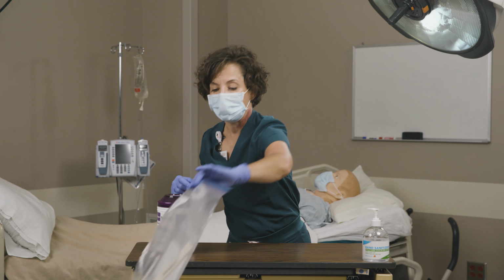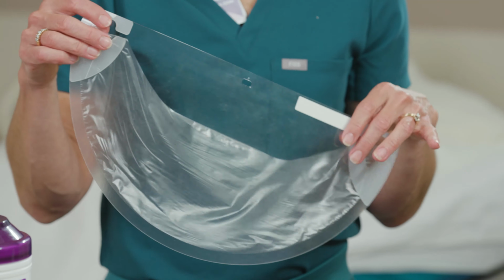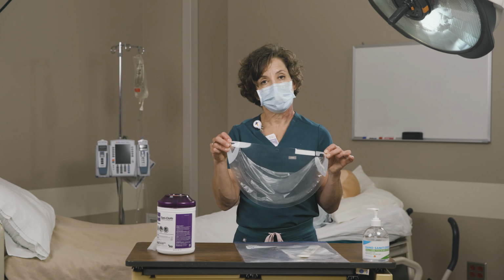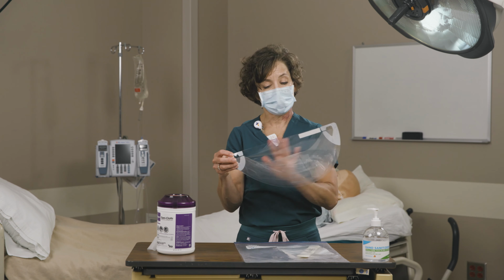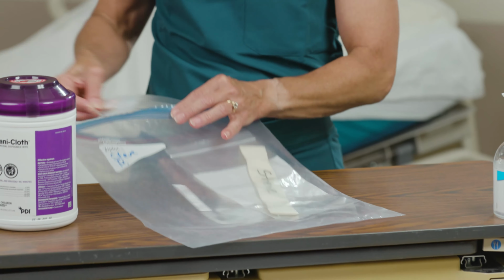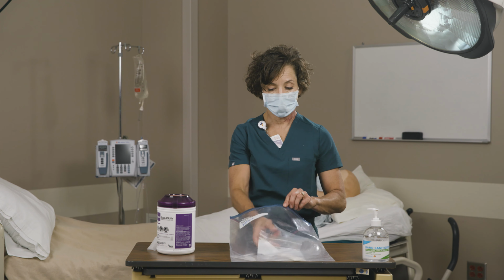Now we're going to talk about our lens cuff and our comfort strips. As Stephen demonstrated in our donning and doffing demonstration with the CAPR, we have been reusing these lens cuffs, and many caregivers have found that we can disinfect them, the front and the back, both sides, and successfully use them over. We store them in a 2-gallon Ziploc as well, and then the designated comfort strip for that caregiver can be stored in there as well.